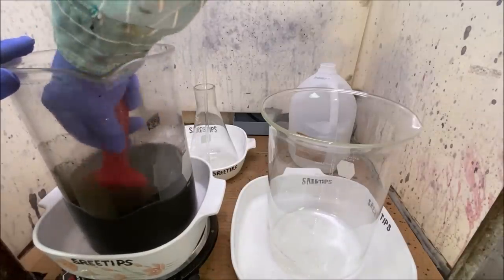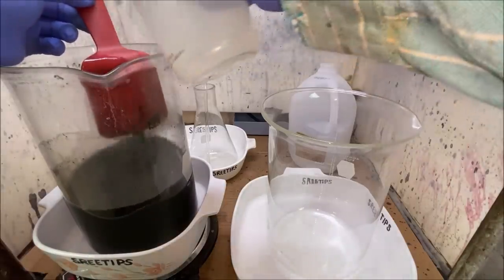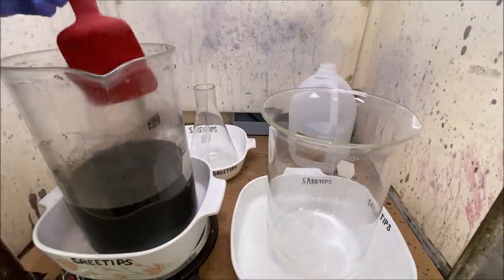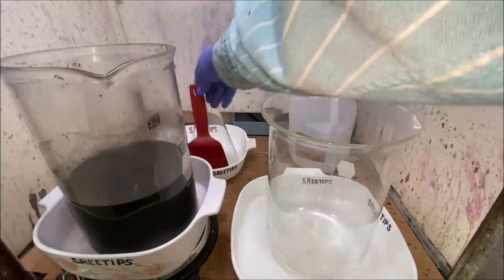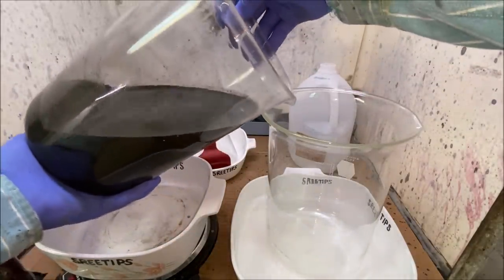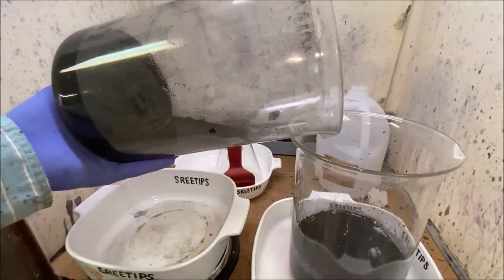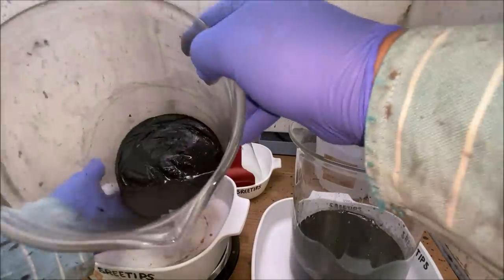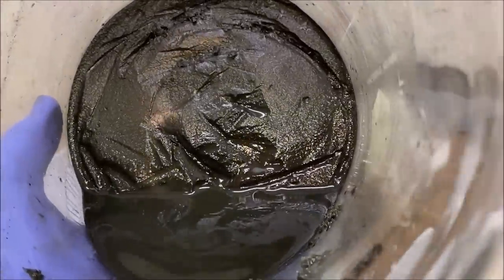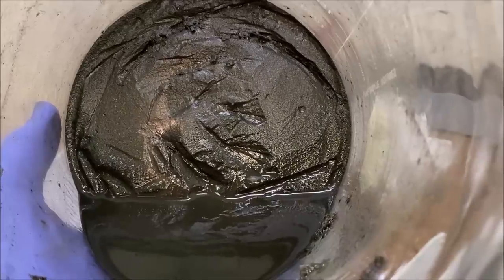This stuff is compacted down on the bottom of this beaker. It's cemented together into a solid block down there, so I'm gonna have to bust it up with something rigid here. Before I do that, let me get rid of this excess liquid into this clean beaker. What do we got down there? Solid block of cement. I have to get in there and break that all up and get it loosened up.